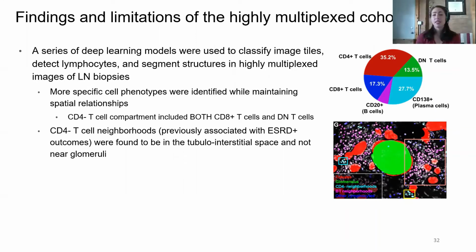Yeah, so this is maybe 10 or 11 out of the 25 markers that we have. Fibroblasts aren't in this panel. We have another experiment getting started where we have a 40 marker panel and can explore all of these relationships in even more granular detail. But what we're interested in moving forward is looking at the dendritic cells and antigen presentation within these neighborhoods, and seeing if we can detect antigen presentation within these large BT neighborhoods. That's what's driving the research behind those interesting ones right now.